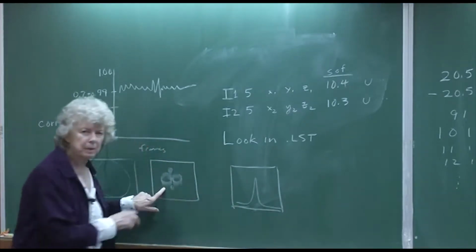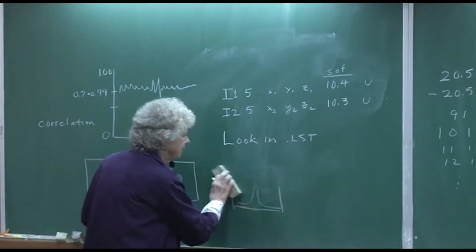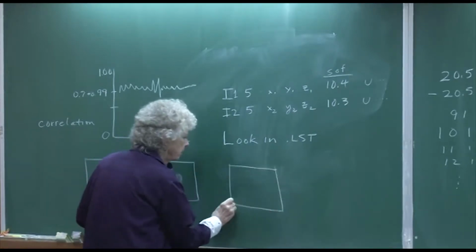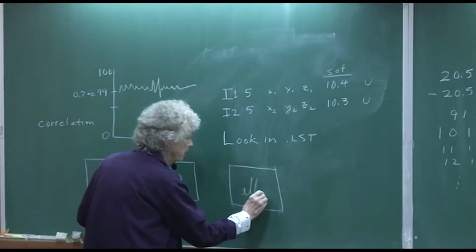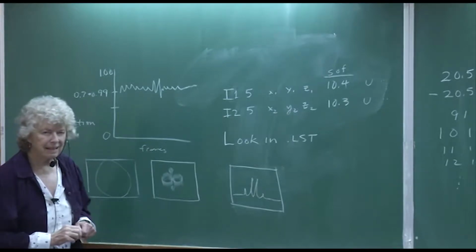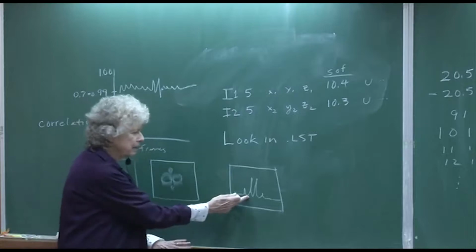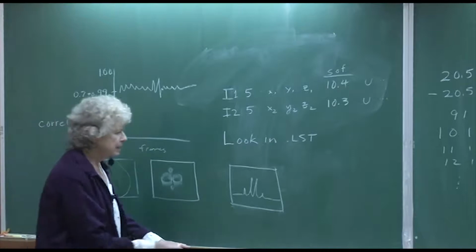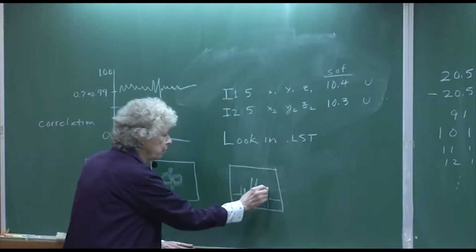But if you have this situation, it's probably going to look more like something like, so there'd be a little one, and then another one, and then another one, and another little one. It's not death. It doesn't mean it's not possible to solve this structure, especially if that's due to cracking and not something like bad twinning. If it's simply cracking, then you just want to make sure that you integrate the whole thing here.